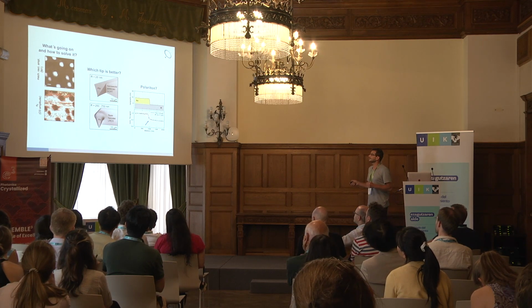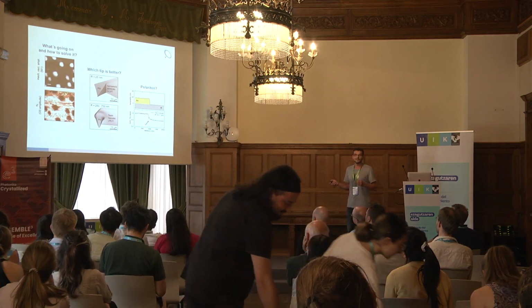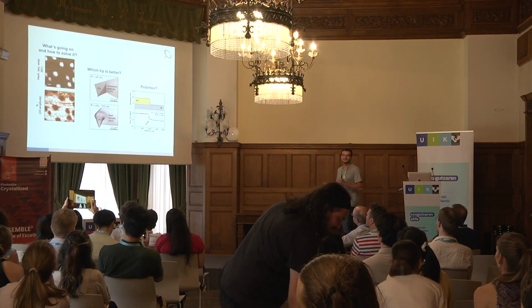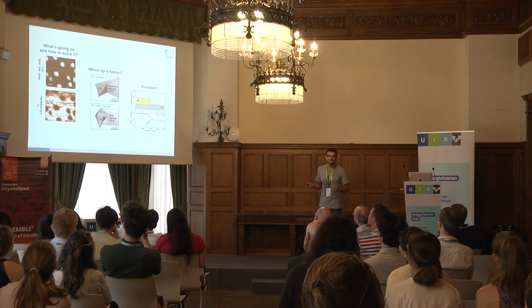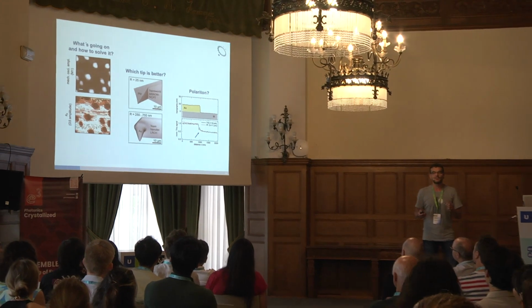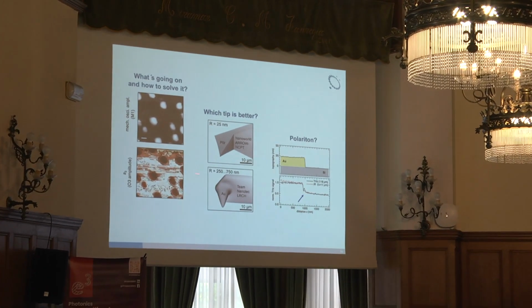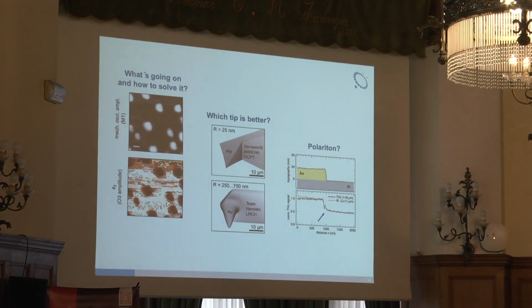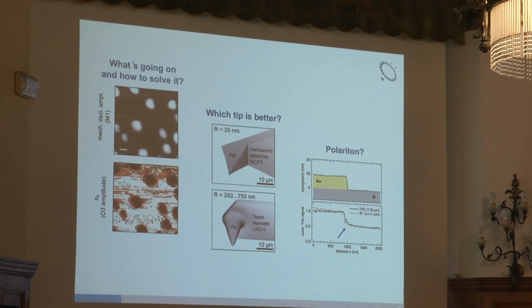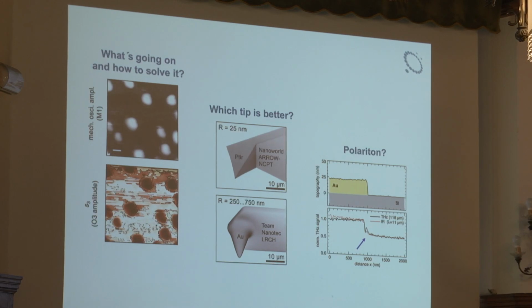So these are 3 topics I have chosen because they're interesting. Here, for example, that's a long story that I had many discussions with Fritz since my PhD thesis 20 years ago. Which tip is better, a sharp tip or a blunt tip? A sharp tip makes more field enhancement, a blunt tip less. Which tip is better? And we could have many days and weeks of discussions we had, actually. I can give you the solution, but maybe I give you some seconds to think about it. Okay, so that's the first question that I have.